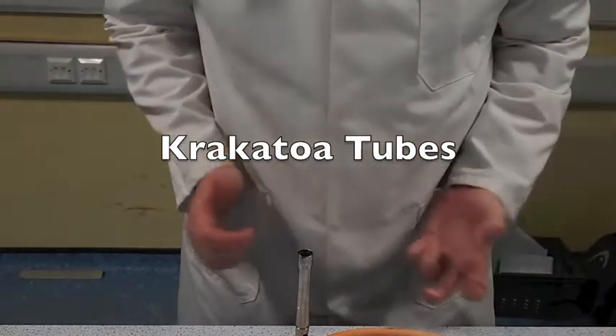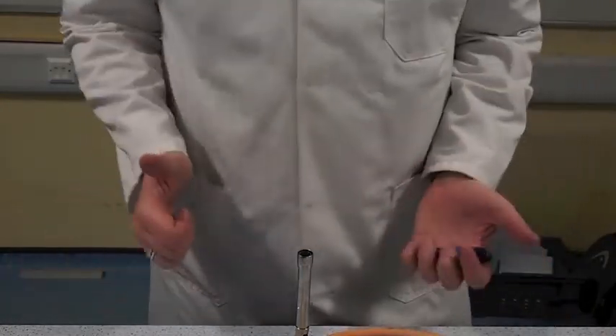Hello, it's Mr. Bell here with another stupid and dangerous thing to do. And today I'm going to be making something called a Krakatoa tube.